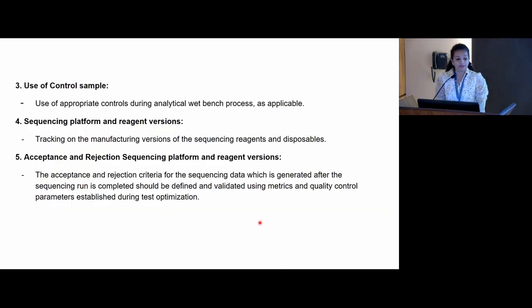Moving on, with the run we need to have a control sample. If there is any contaminant in our reagent or environmental contaminant, that can be excluded by using a control run. So after our data is generated, we can simply nullify the control sample or normalize the contaminants from our samples, and we can get the exact count for our sample mutations.